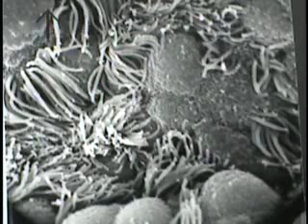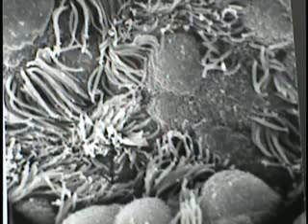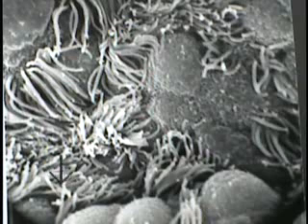A small portion of the bronchiole epithelial lining as viewed from the surface in another scanning electron micrograph, but one that was taken at increased magnification, simply to illustrate in greater detail the dome-like apices of the non-ciliated cells, as can be demonstrated here, as well as demonstrating without much question that some of the cells possess or retain, even this far down, numerous cilia.